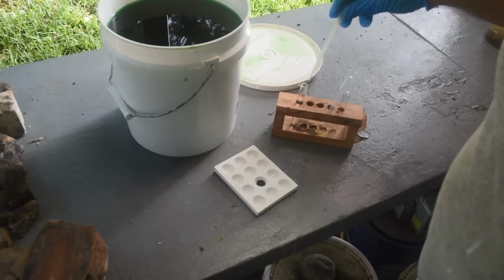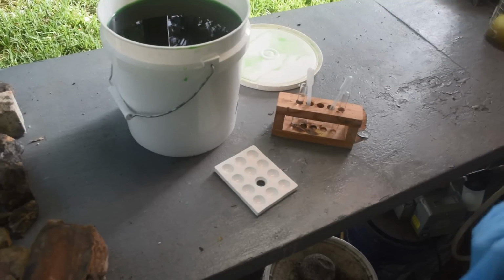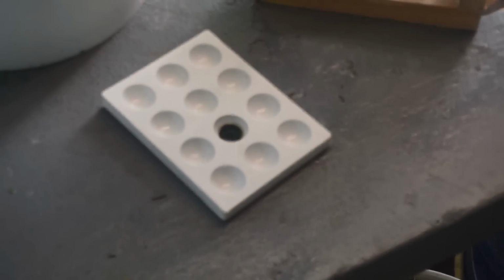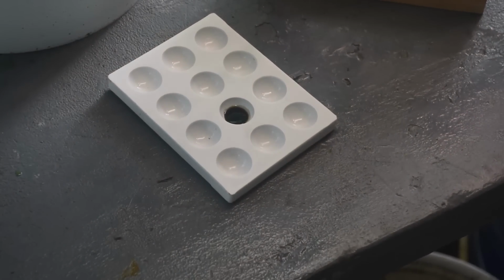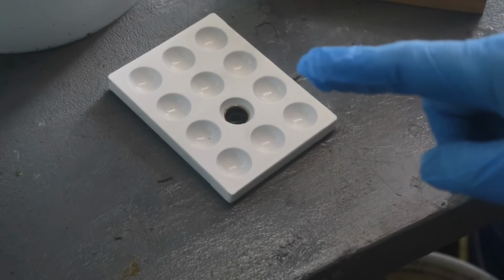Okay, now this is an interesting result. I'll give you a close-up on that. That, to me, does not look like an indication for palladium. What that looks like to me is an indication for gold. So I think I'd be surprised if we got all the palladium out of this. There's probably still a trace in there.